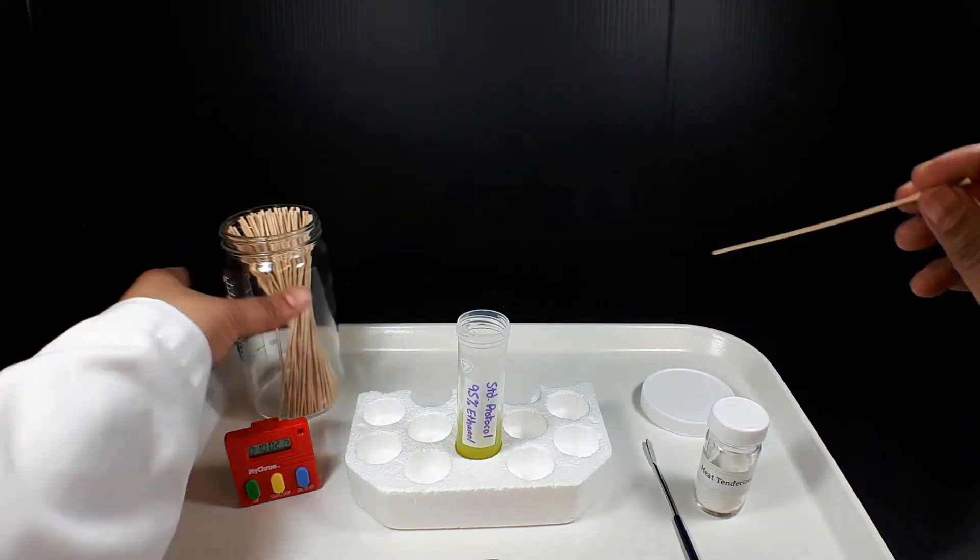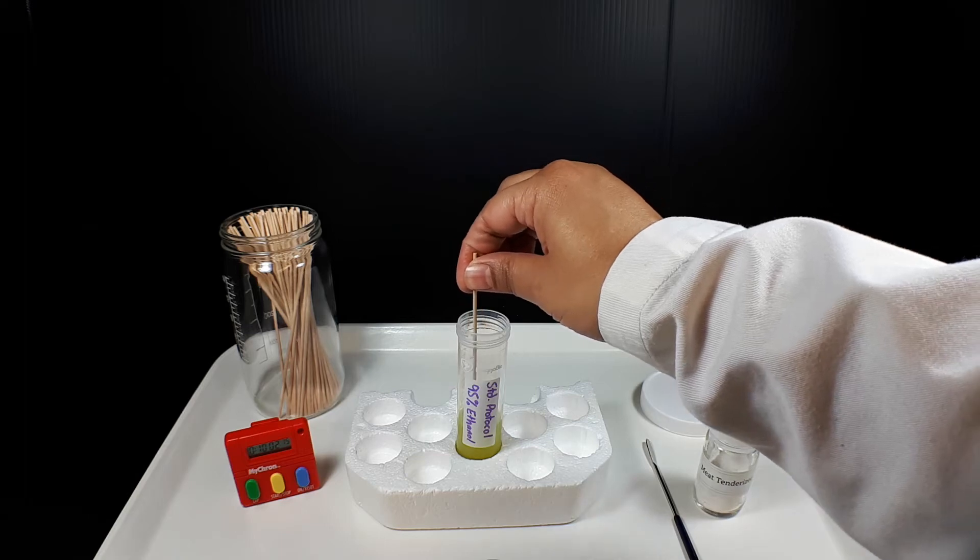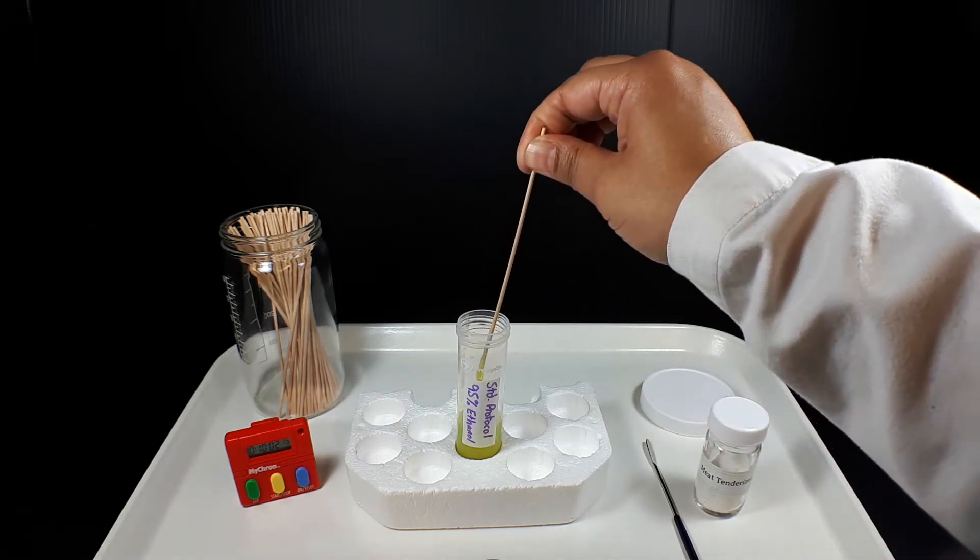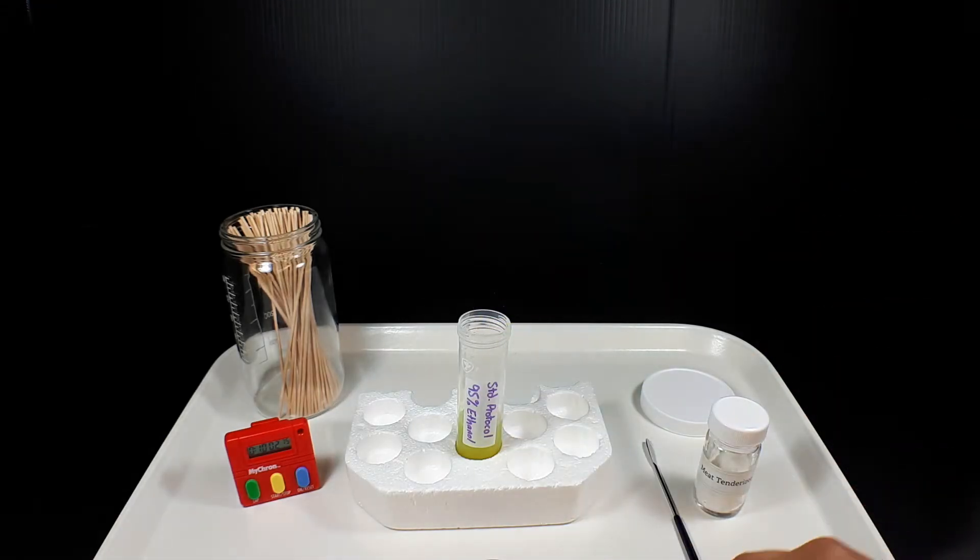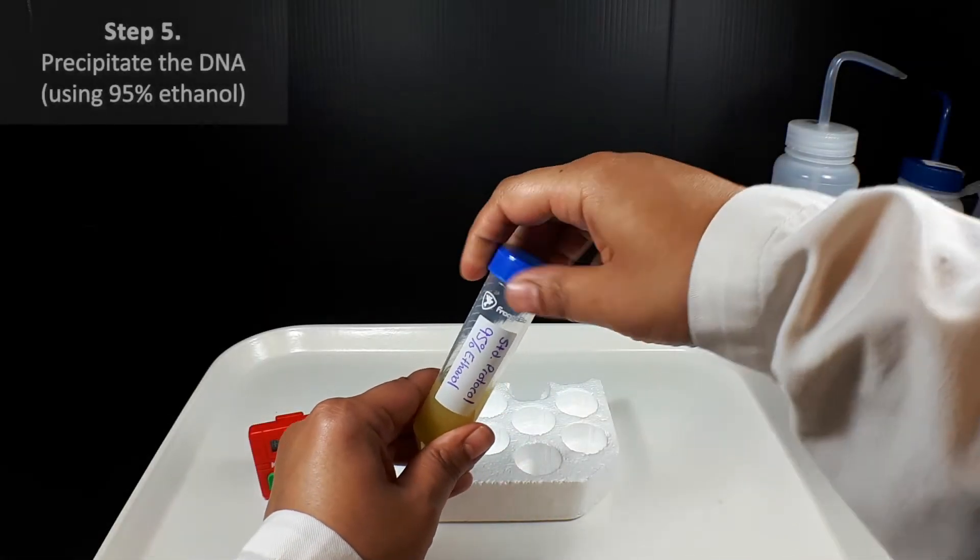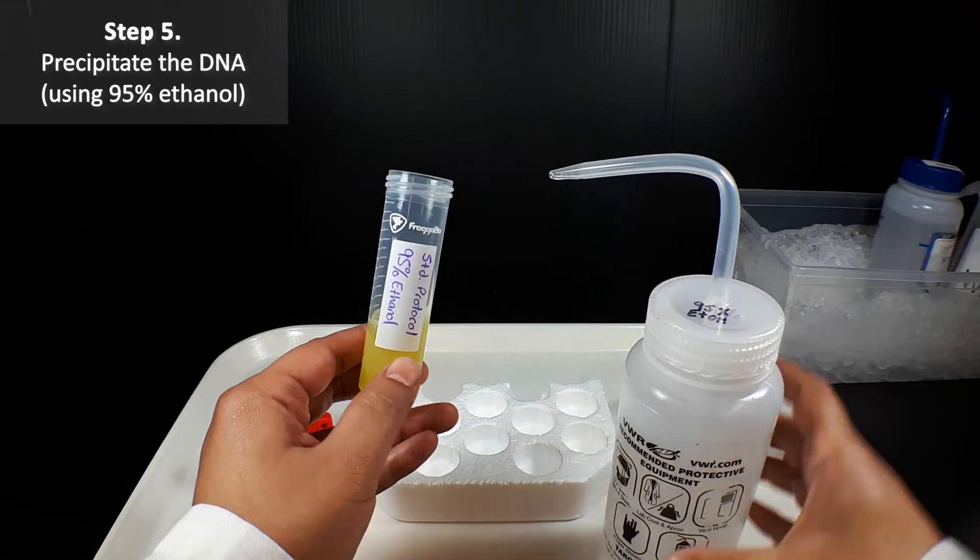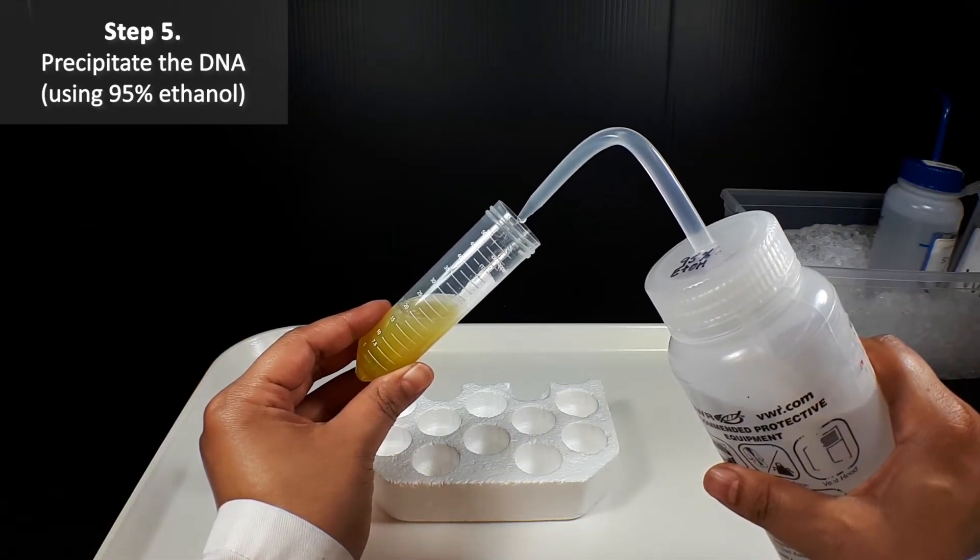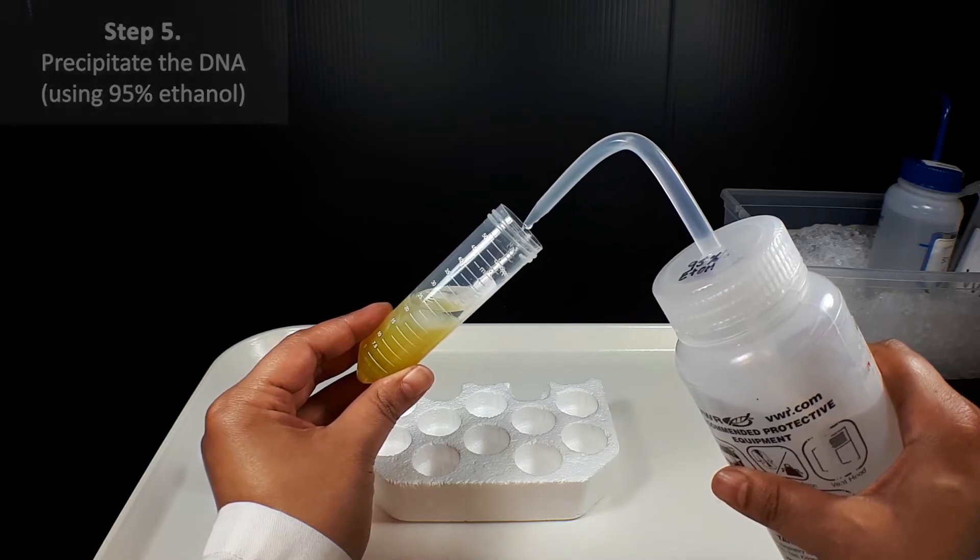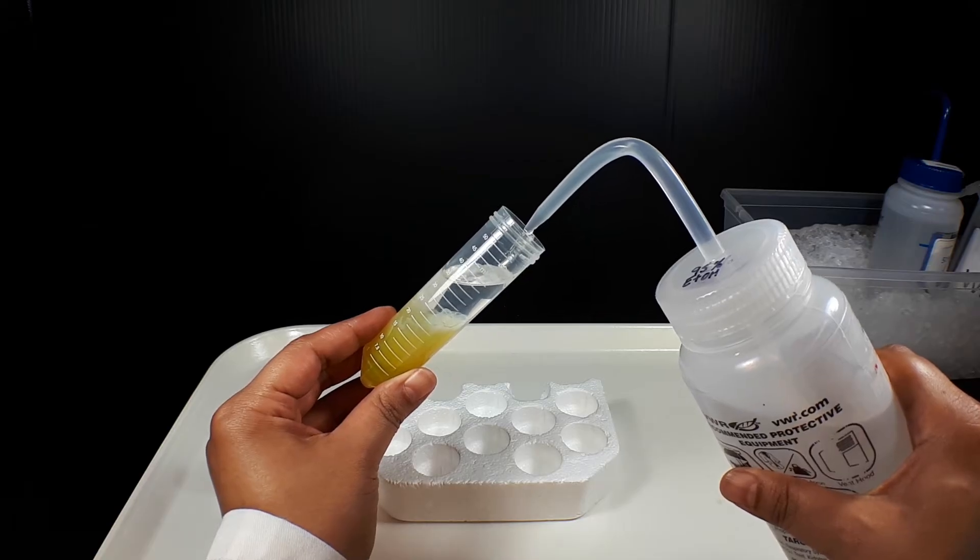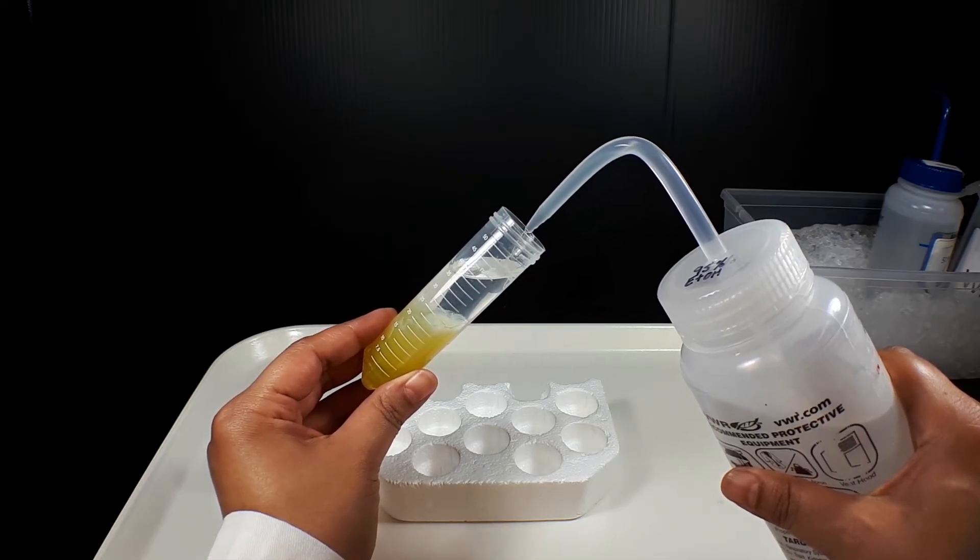Stir the protease into the mixture very gently, since over-mixing can break apart the DNA. We're finally ready to precipitate the DNA. Slowly add 20 milliliters of ice-cold 95% ethanol down the side of the tube, so that it forms a layer on top of the extraction mixture.